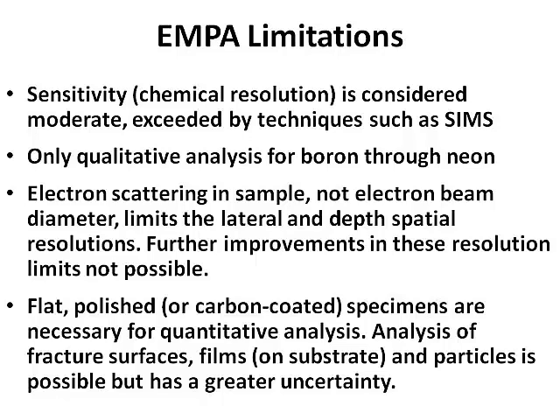Because the specimens need to be flat and polished or carbon-coated, analysis of fracture surfaces, films on substrates, and individual particles is possible, but it does have a greater uncertainty.